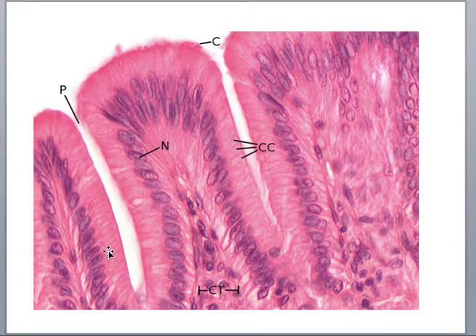Here's another super beautiful simple columnar epithelium, right? So this would be where the basement membrane is because it has all this connective tissue below. Up here, this would be free apical space, right? Again, look, you can tell these nuclei, this is a single layer of cells. Nuclei are somewhat oval-shaped, elongated, closer towards the basement membrane. And these cells are taller than they are wide.